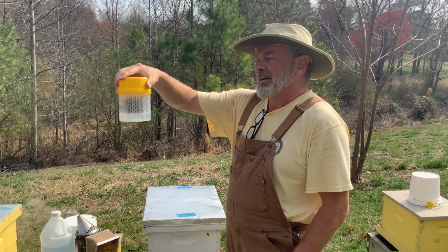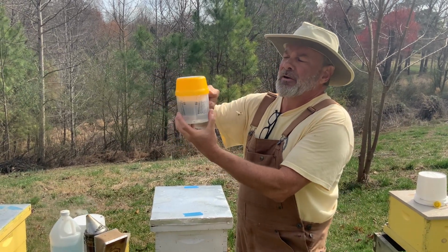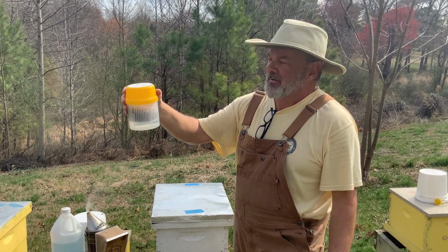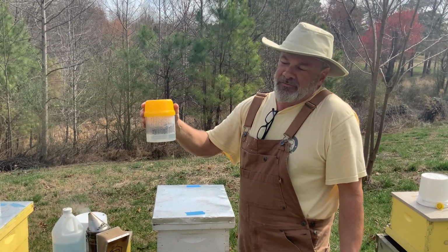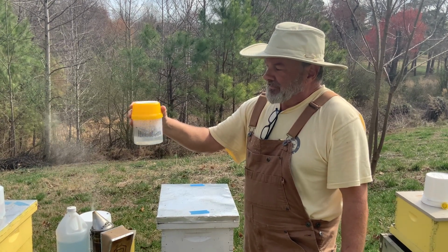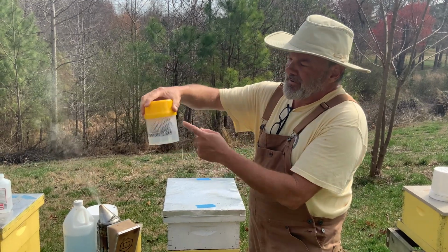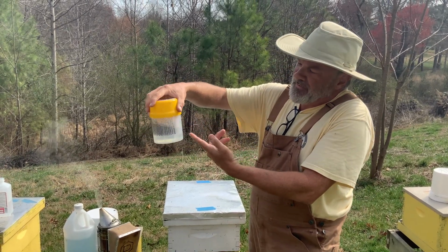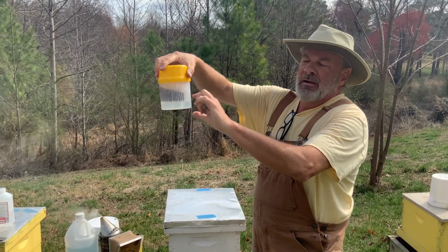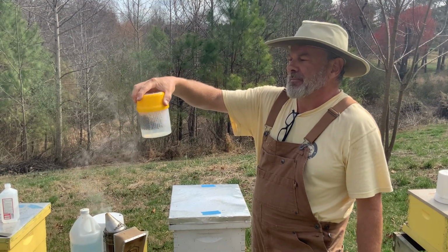If you're shaking it, you may or may not get the mites loose, and you're definitely going to cause any kind of leakage to be more pronounced when you're shaking it instead of swirling it. So we want to swirl it for approximately 30 seconds. If this had detergent water instead of the alcohol, you'd see it foam up a bit, but the bottom half or more of the liquid would stay liquid and the foam would be on the top.